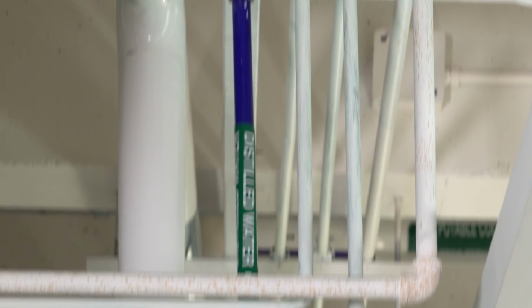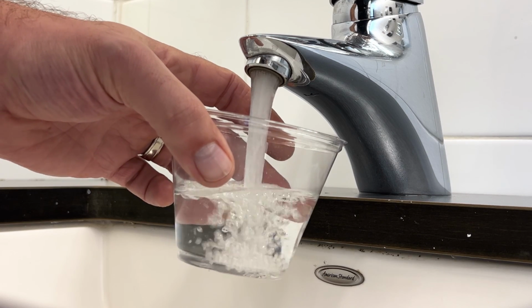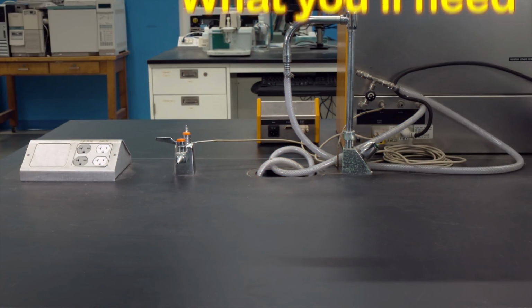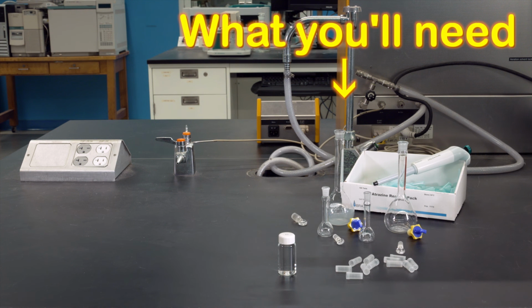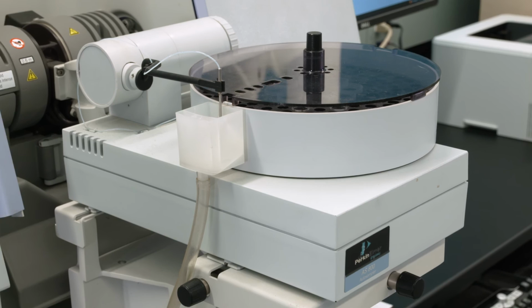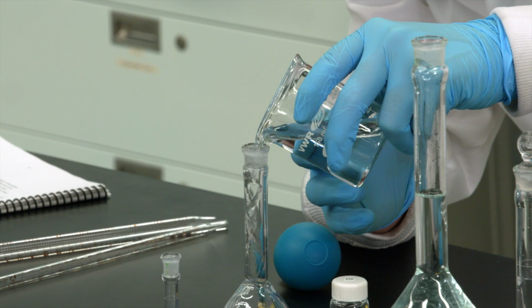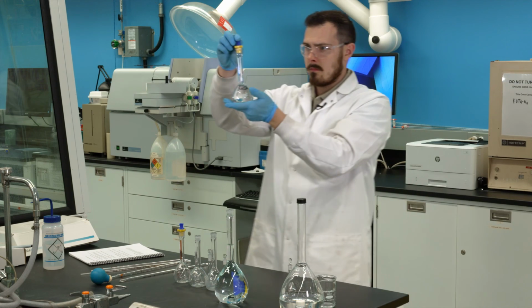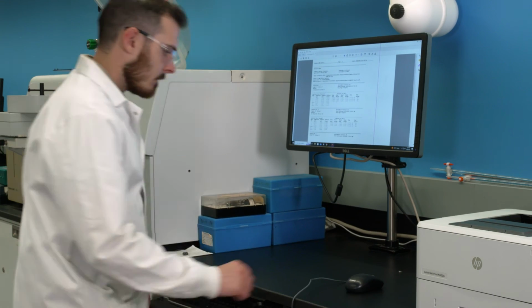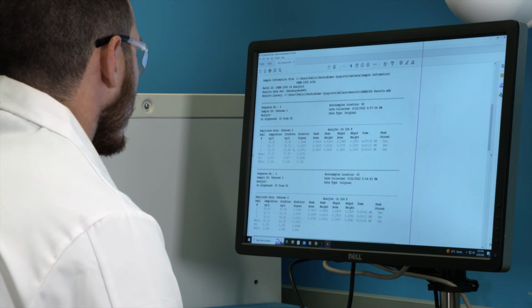Pipes carrying water can be made up of different materials, with one notably being copper. Leaching of copper can occur, contaminating drinking water. Today, we'll provide you with a method for quantifying this trace metal in water using graphite furnace atomic absorption spectroscopy, or GFAS. Although minimal sample preparation is needed here, a lot can still be learned from this experiment. Key takeaways will be how to use GFAS, create calibration curves, and quantify copper in your unknown samples.